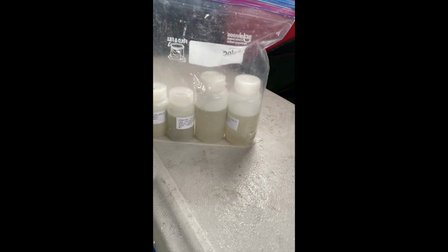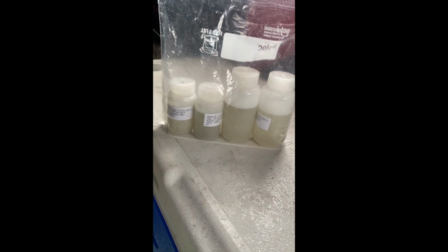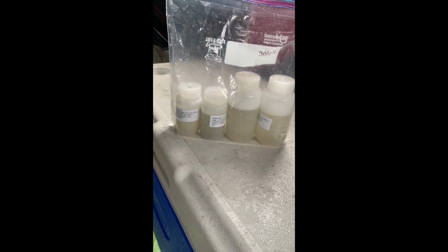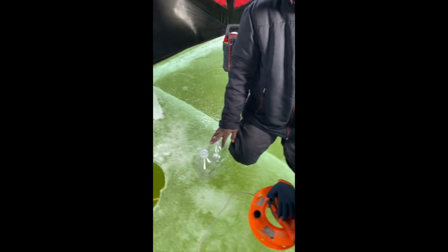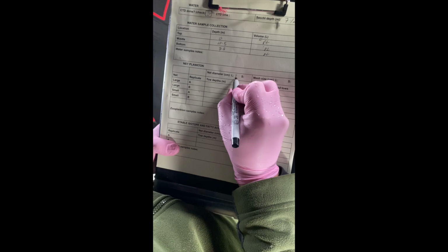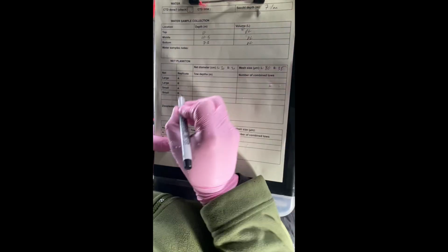So we finished collecting our quantitative zooplankton samples. We have duplicates of the 80 micron mesh tows in the larger bottles, and duplicates of the 35 micron mesh tows. So we're going to record some information about this. Net diameter, 30 centimeters for both; mesh size, 80 and 35.